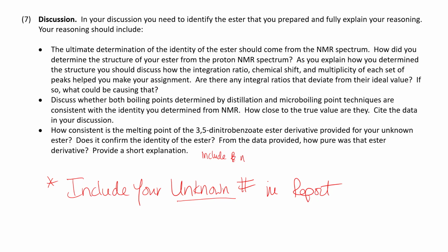Again, these are all student-derived pieces of data, so they're not data that I just made up. They're from student reports. I may have modified them slightly so that everybody would get the correct answer if you do the analysis properly. So also include the refractive index as well.